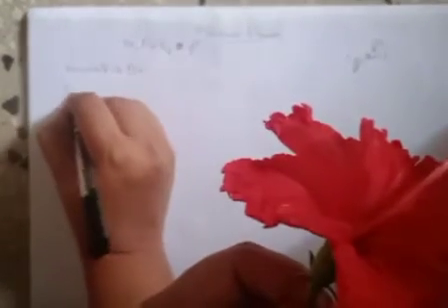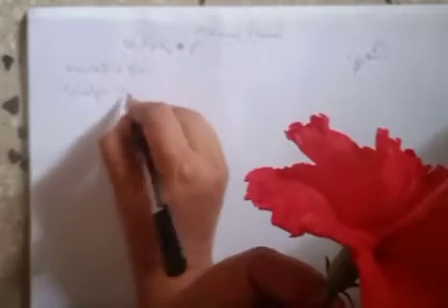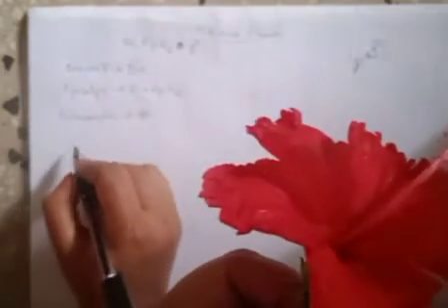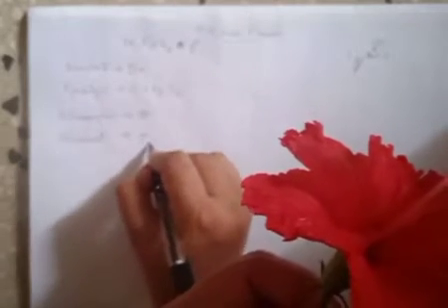Okay, then I have also said there is an epicalyx, and there are 6 epicalyx, which I stated as epic 6. Then I said it is actinomorphic, so it has radial symmetry. So I have stated it as actinomorphic. Then I have said it is bisexual. I have presented it as a bisexual flower.